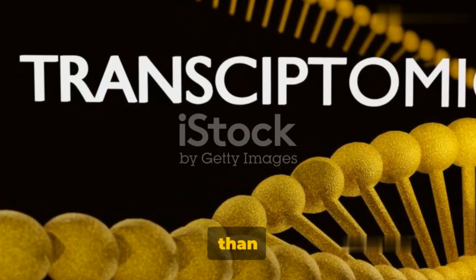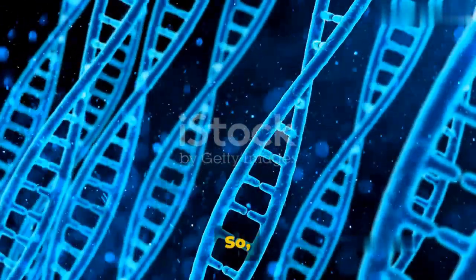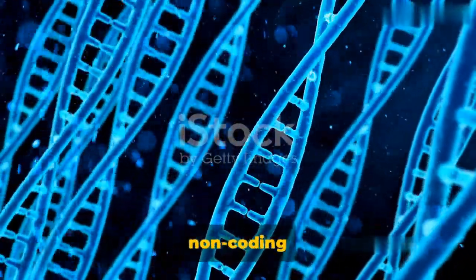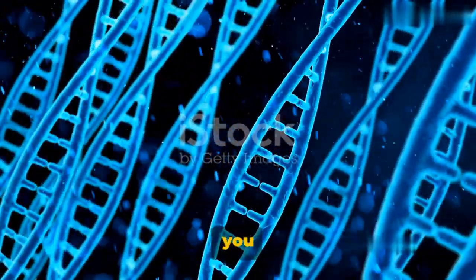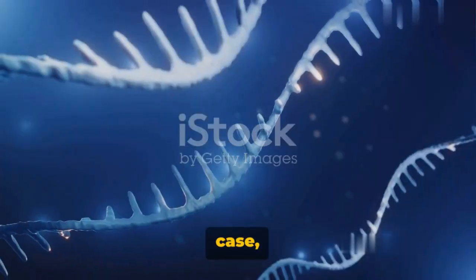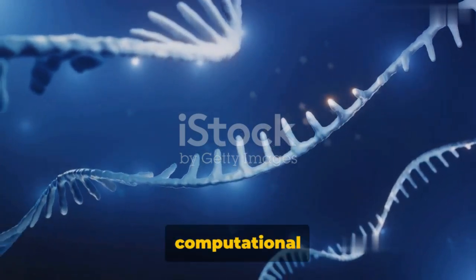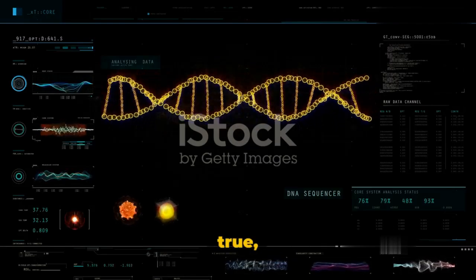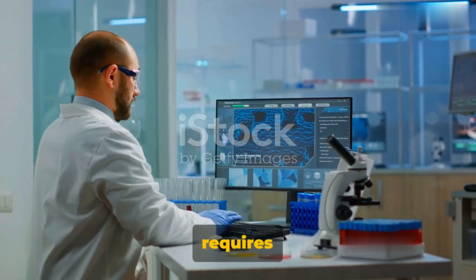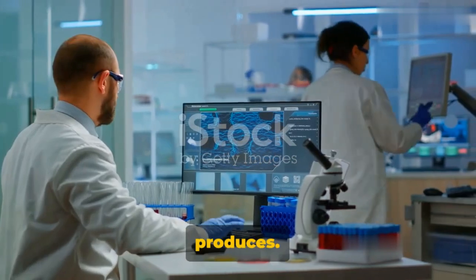It provides a higher range than microarrays, meaning it can detect a wider variety of RNA types. So, whether you're dealing with messenger RNA, microRNA, or other non-coding RNA, RNA-seq has got you covered. However, with great power comes great responsibility, and in this case, that responsibility takes the form of higher costs and the need for more computational resources. It's true, RNA-seq isn't the most budget-friendly option out there. It also requires a hefty amount of computational power to analyze the massive amount of data it produces.